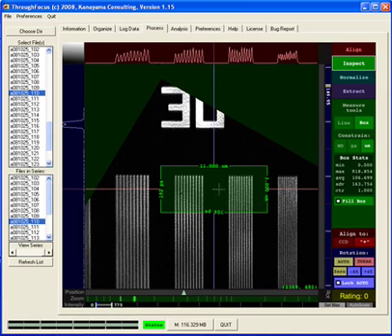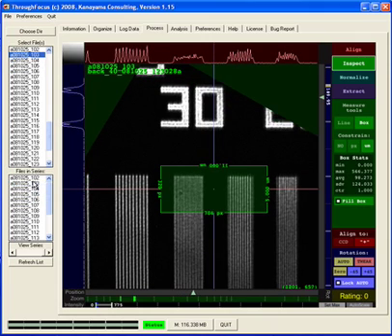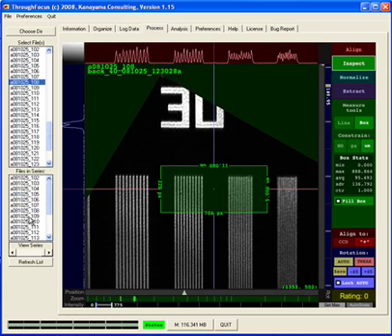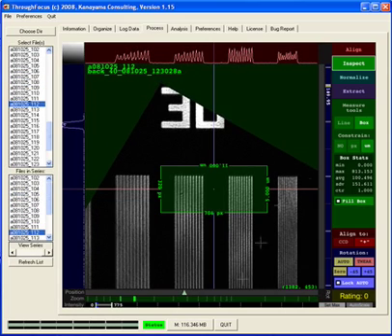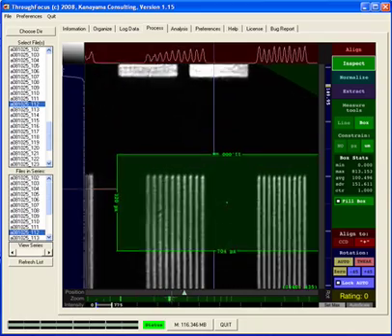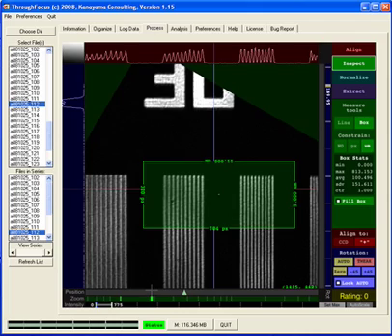I want to remind you that once you set it for one image, it's set for the whole series. So you can see if I go through these different images here, it's all going to be aligned because we took the time to align the images first. So if we zoom out, we can see the region where we're going to be performing the analysis.